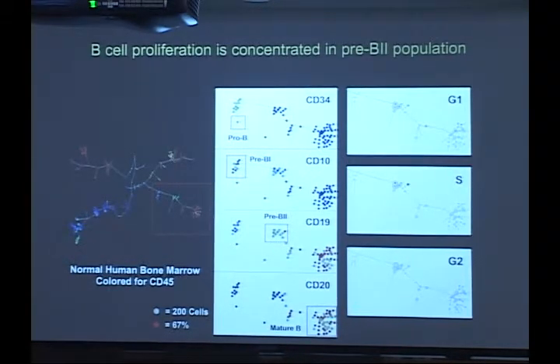When you actually look at primary cells, the fraction of G2 is much lower than in cell lines, and probably this is because a lot of the G2 cells in cell lines are really checkpoint arrested at a G2/M checkpoint, as opposed to being in a classical G2. And when you look at embryonic stem cells, for instance, you also don't see a very large fraction of G2 cells. So this is what we believe is a normal distribution.